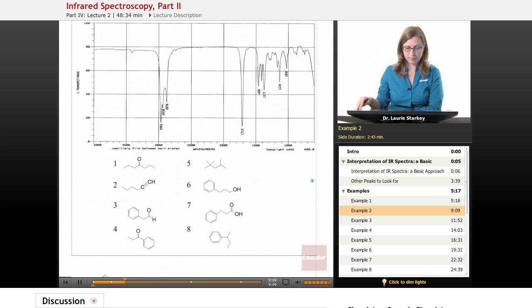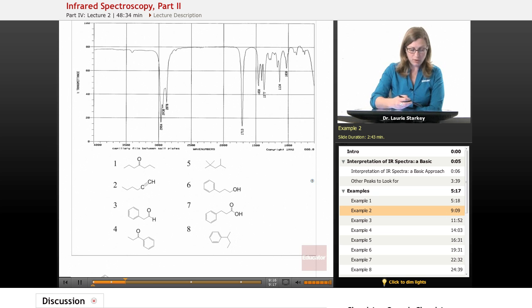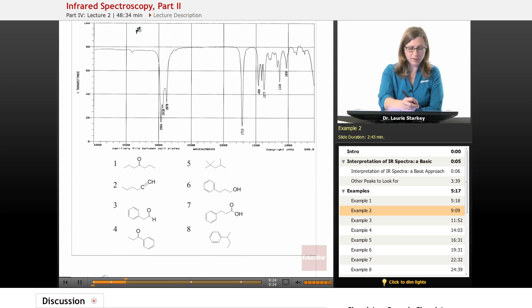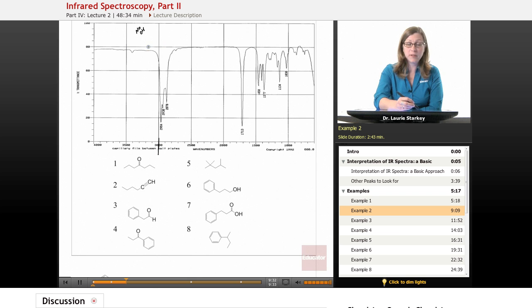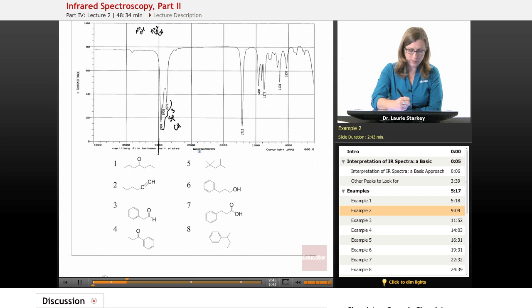Let's try another one. We start by reading the spectrum from left to right. The first thing we look for around 3300 is an alcohol. Do we have any OHs? We have this tiny little blip, but that doesn't look like anything significant — so no OH here. We continue to 3000. Looking just above 3000, that's empty, so there's no SP2 CH. Just below 3000 we have our first significant peak — SP3 CH.